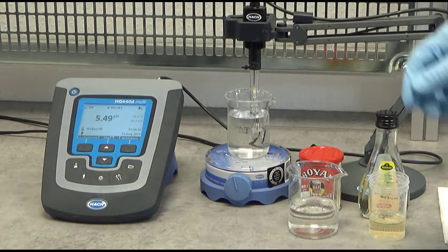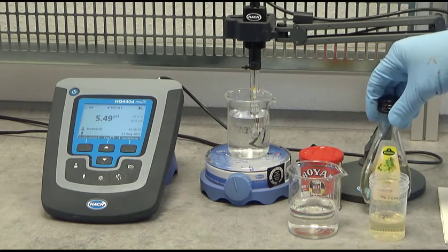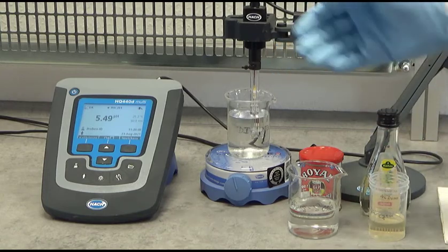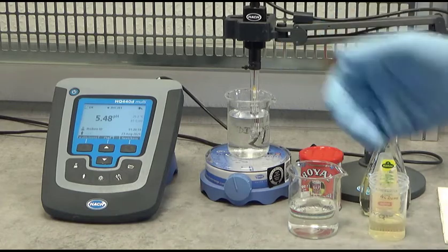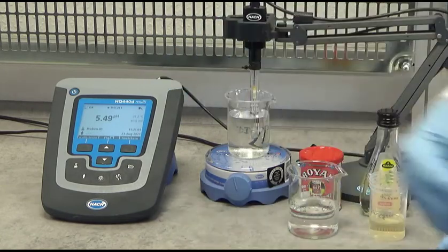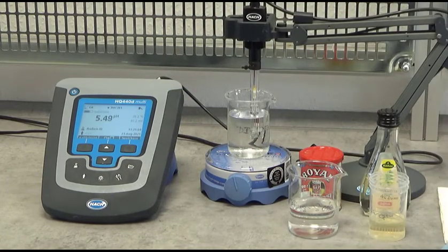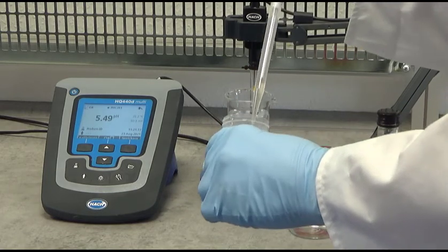What we're going to do now is add drop by drop a few milliliters of regular vinegar to the water sample. Vinegar is a little bit acidic, with a pH of approximately 3. We will watch what the pH of the water sample does while I'm adding it. I have our pH meter here, the HQD, and you can see the deionized water sample has a pH of approximately 5.5.